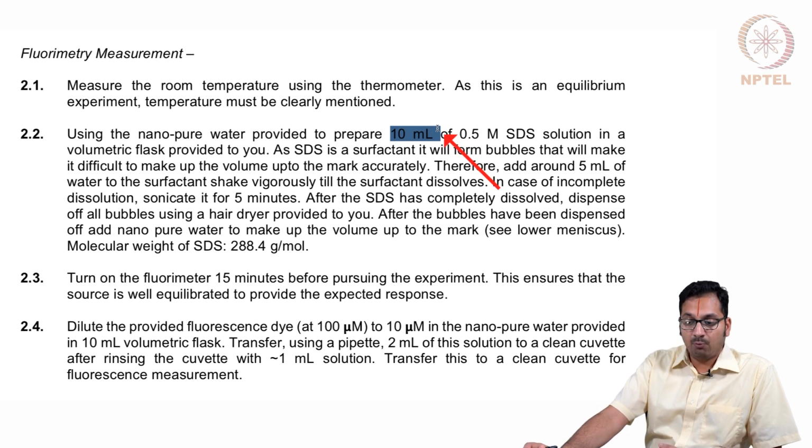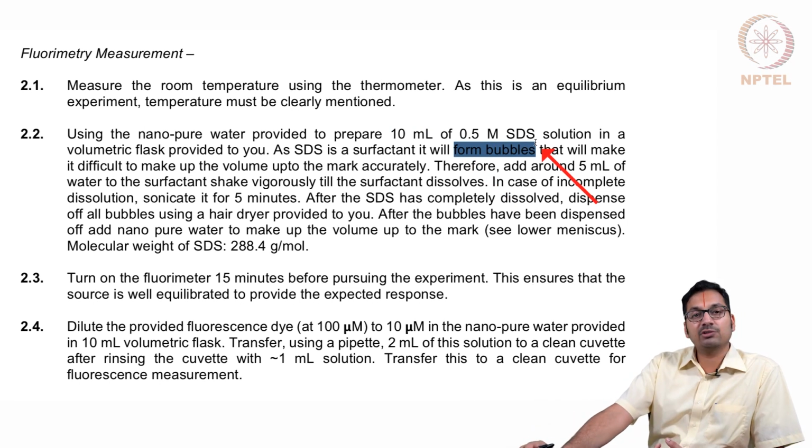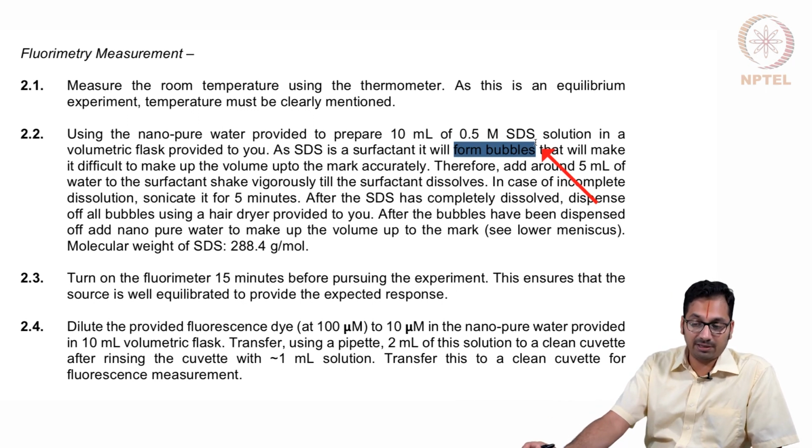One should remember, since SDS is a surfactant similar to your soap, if you are adding soap to water, it's going to result in the formation of bubbles, and this could make it not easy for you to determine the meniscus of this solution in the volumetric flask.